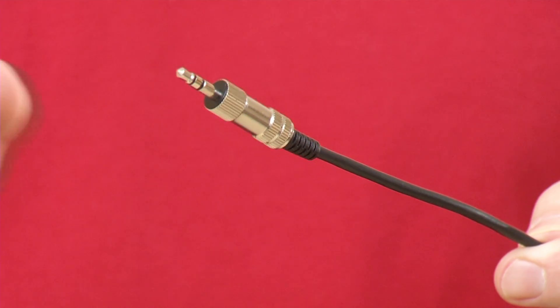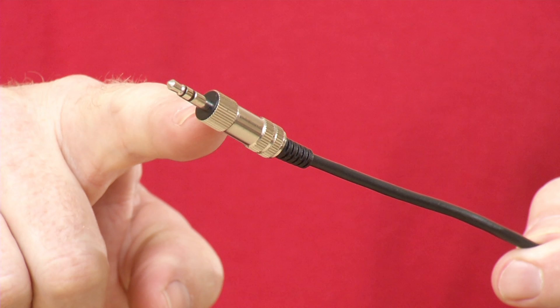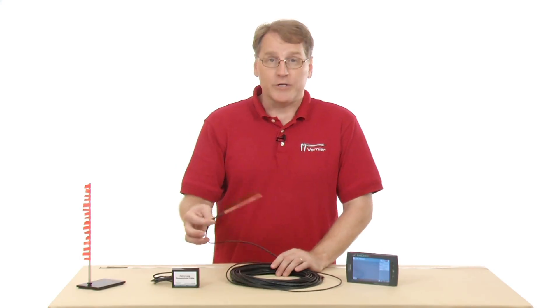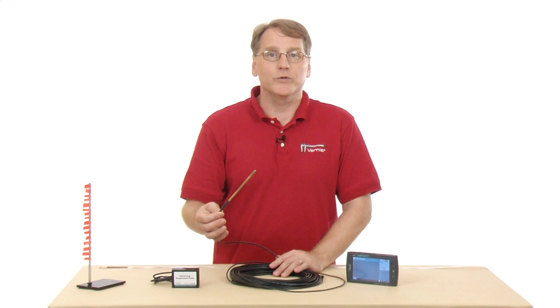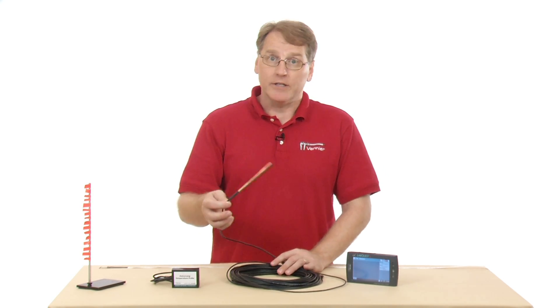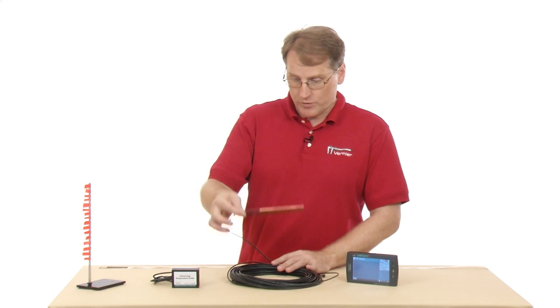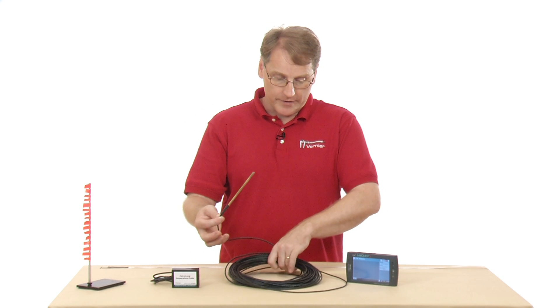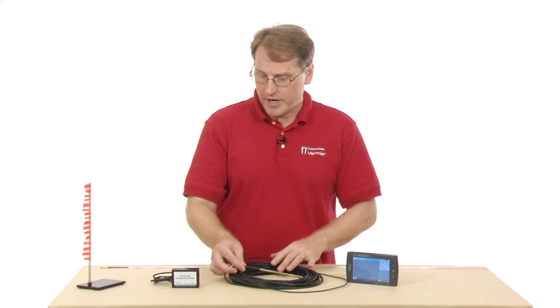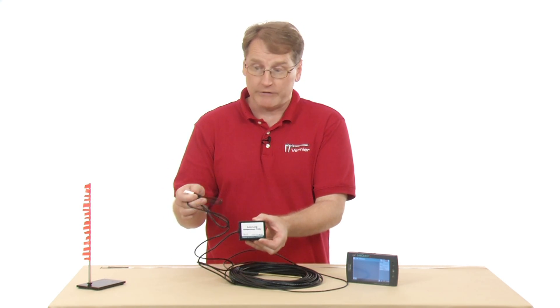You can submerge the extra long temperature sensor up until the end of the black wire at the metal tip. One of the common uses is to do a temperature profile of a lake or pond, and we're actually going to do that today. It's actually two pieces — the wire and the sensor, and then it plugs into a part that connects to your data collection device.